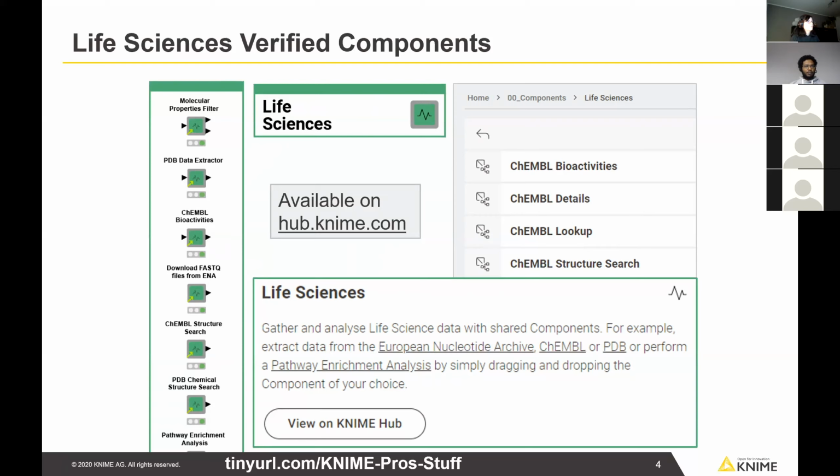All these components, you will find them under the example server, under components. If you connect to the example server on KNIME Analytics Platform, and then go to 00 components under life sciences, you will find all these components, and you can drag and drop them to your KNIME workflow.